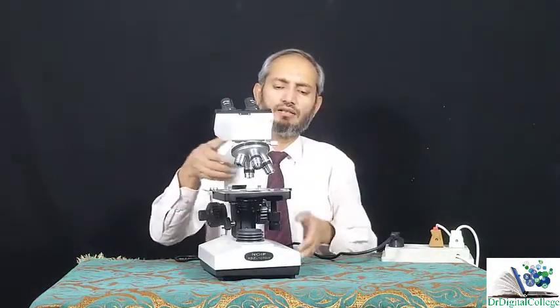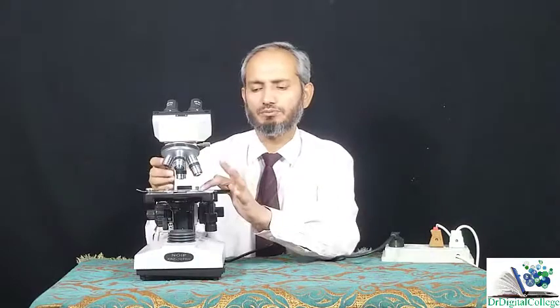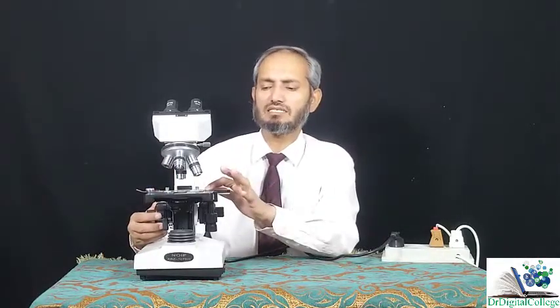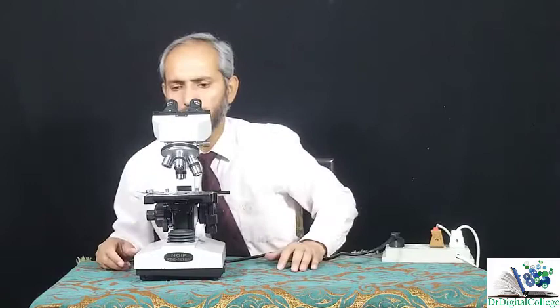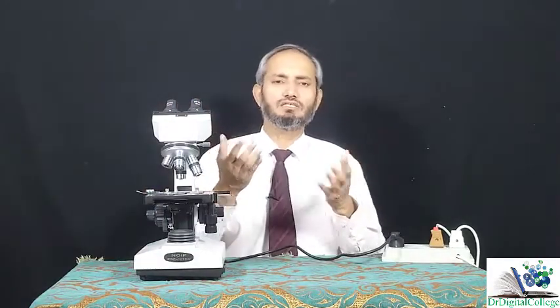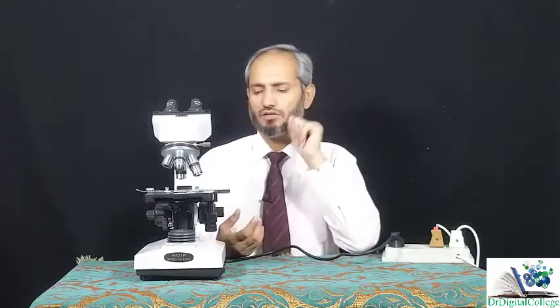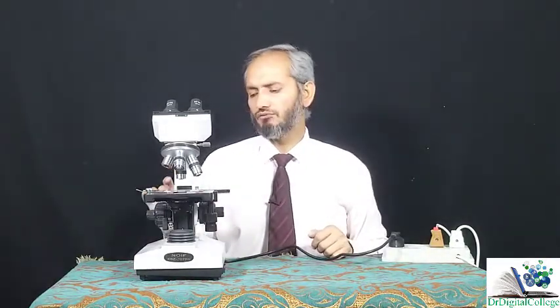So for example, if you have focused your object and while you are doing your drawing, somehow or the other, some of your classmates or somebody has lowered this stage like this. When you observe, you will say, oh, my object is out of focus. Now what will you do? You have locked it. You will quickly move the stage upward and it will come to the same position. Okay, so this is the benefit of using your lock.